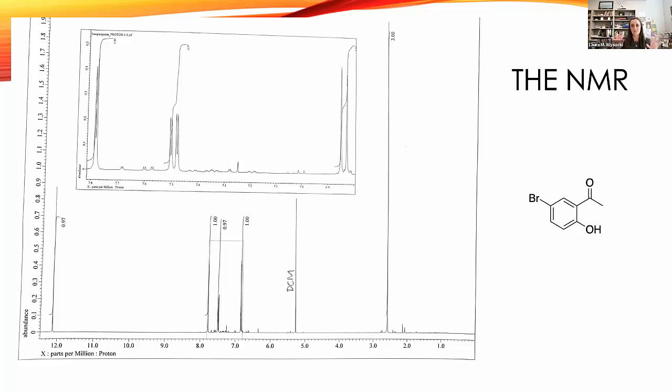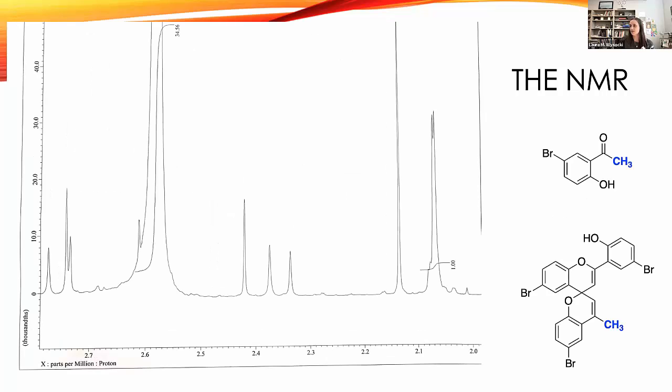Obviously, we've done a little bit more with NMR. It's there, it's just on the baseline. But for a learning gain for them, seeing this first and then zooming in to different regions helps them to understand what they're actually measuring here.